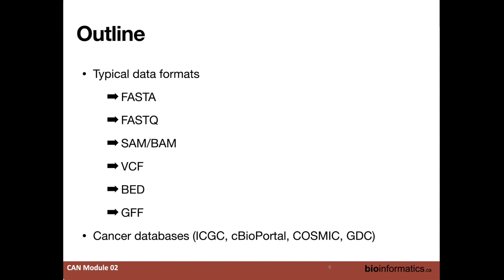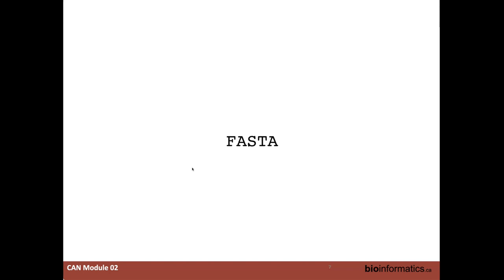So let's just go right ahead and dig into our first file format, which is going to be the FASTA file.